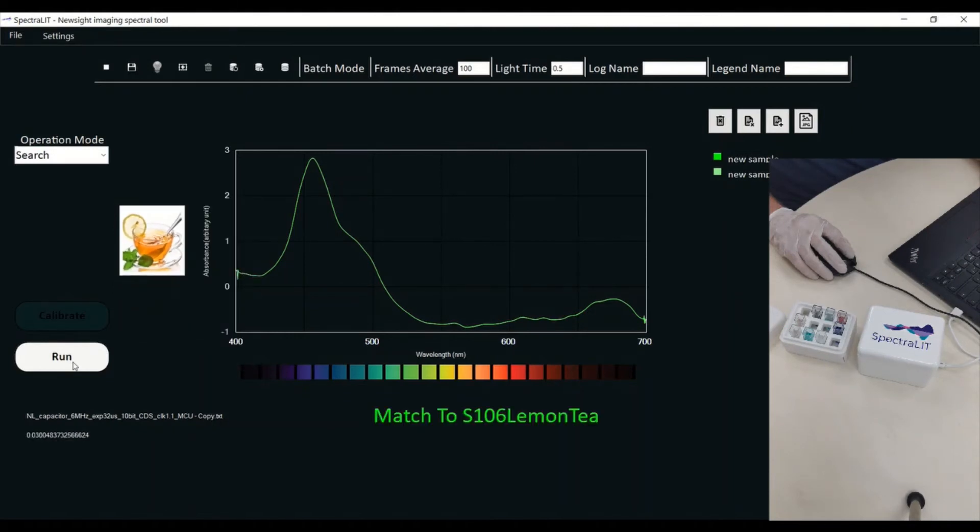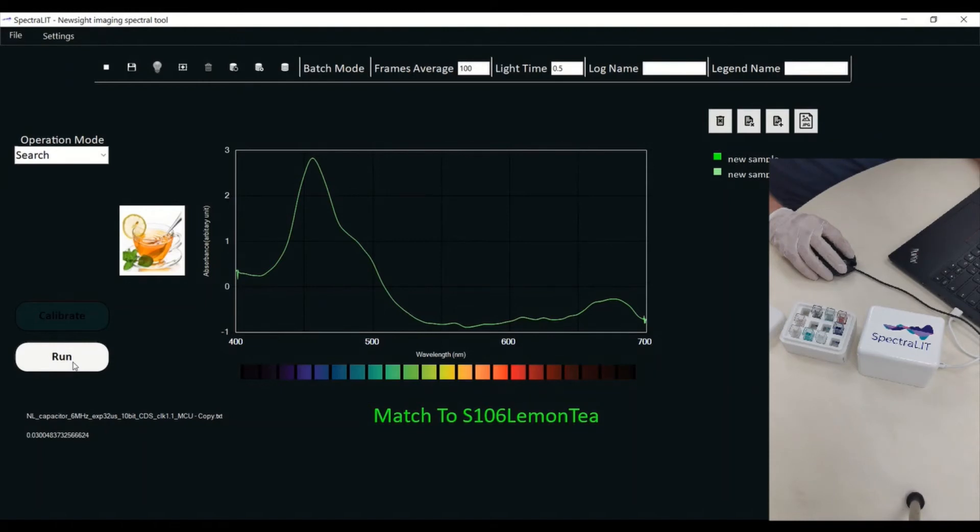So the system can do a complete search of spectral profiles with substances that I have already uploaded into the database.